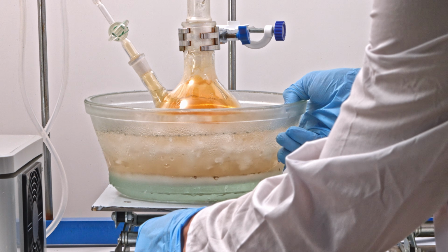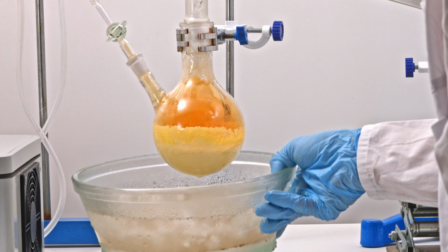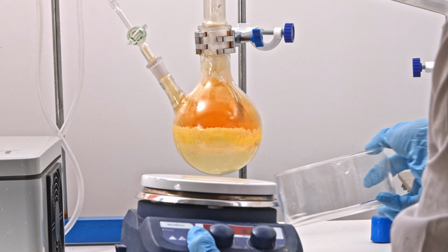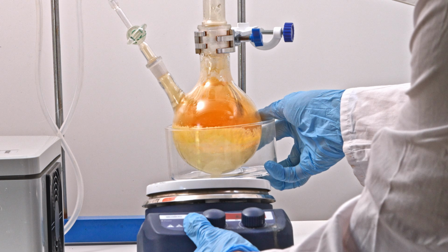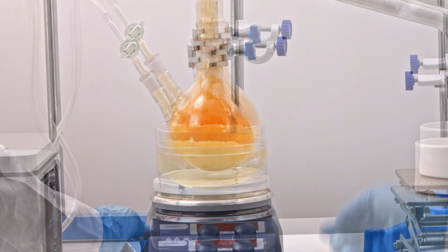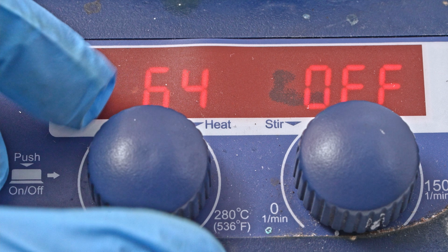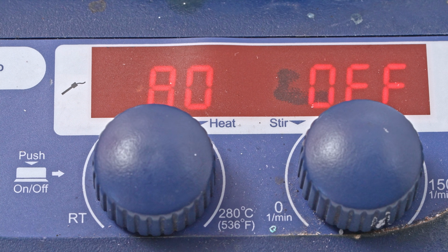Next, I replace the ice bath with a warm water bath. This helps the dinitrogen pentoxide vapors leave our reactor flask more actively and condense in the receiving flask, which is cooled with dry ice. For the reaction to proceed well, 80 degrees Celsius is the ideal temperature.